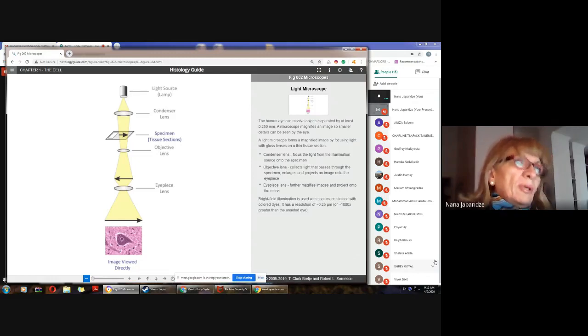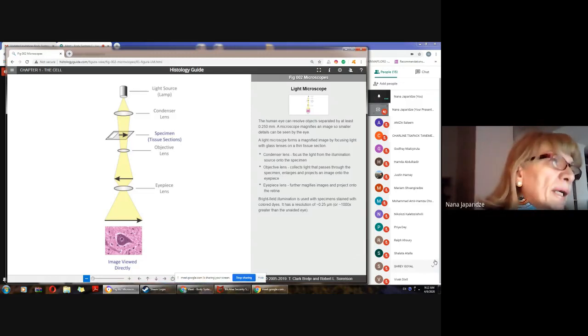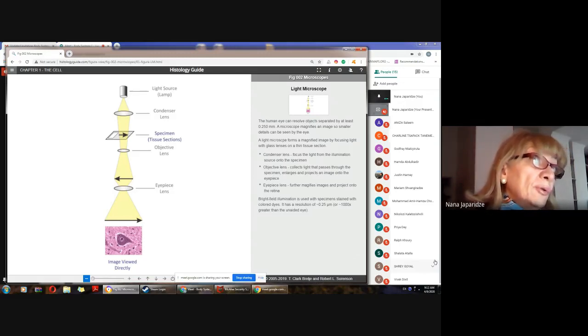So what is this block of tissue? This is a small amount of tissue sample embedded in a block of paraffin, or a block of epoxy, for example in the case of electron microscopy. And then we become able to section this tissue sample. As the main result of sectioning, we receive very thin tissue slices.